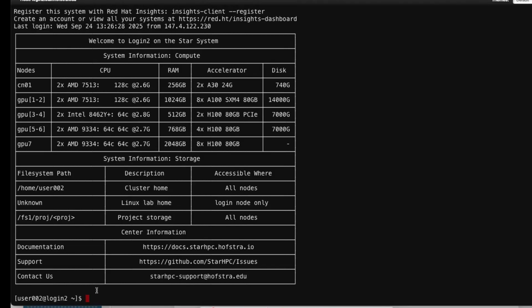Okay, so we're going to be moving around our file system to retrieve the files that we need for this tutorial. And the way we're going to do that is using a command called cd, which means change directories. So the command is cd, and then you have to tell the computer where to go. You have to give it really clear instructions about how to move in the file system. And so I'm going to show you how to find the files that we need, and then you're going to tell the computer how to find it too.